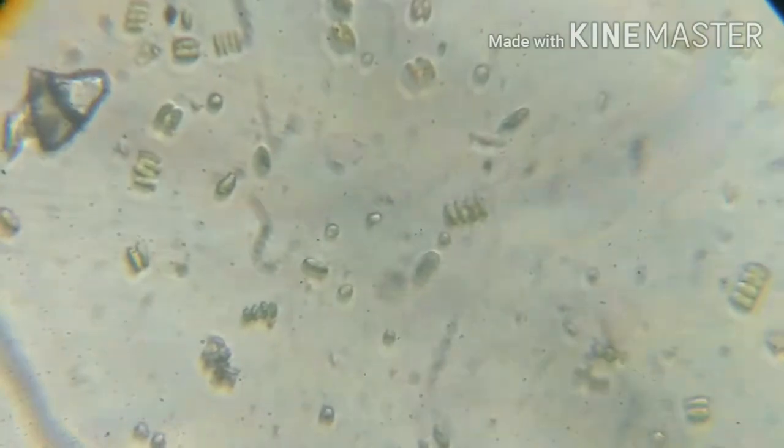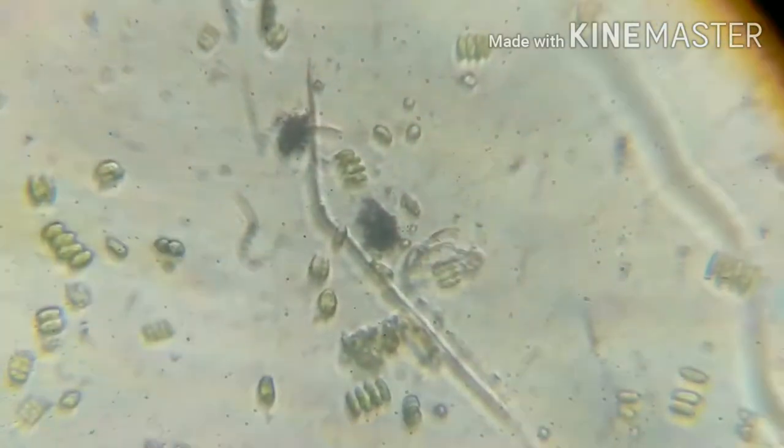And you may be wondering what are those black screens. I'm recording this in a mobile phone, so there may be a little shaking, by which I may be getting off that focus from the light of that microscope.